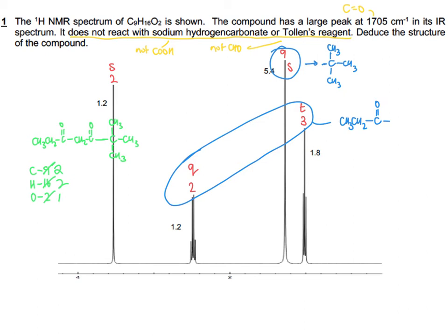So the way we went about it is we looked for any immediate patterns that leapt out at us after we'd thought about how many hydrogens and what's the splitting pattern. Straight away saw that this group had to be in the molecule. That gave us one end. Always look for a triplet quartet. They won't definitely be there, but there's a fair chance they'll be there. Look for your triplet quartet with the quartet having 2 hydrogens and the triplet 3. And then we used the chemical shift to work out that ethyl group was then next to a carbonyl.